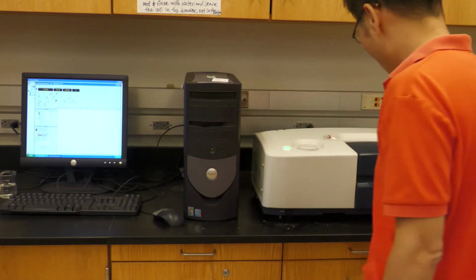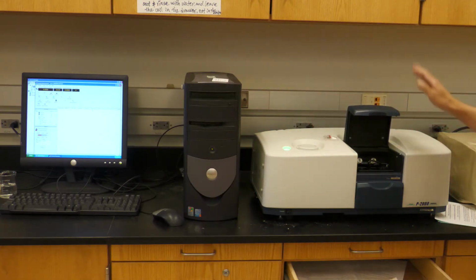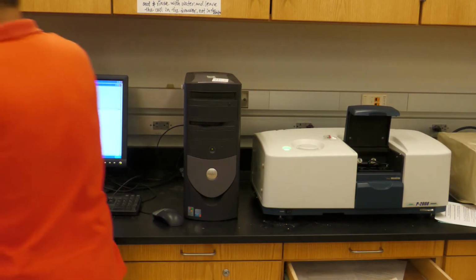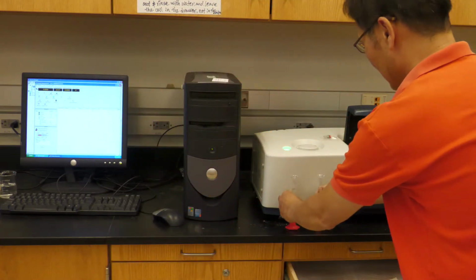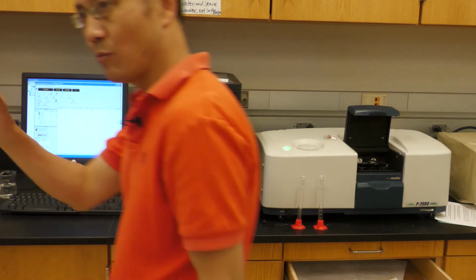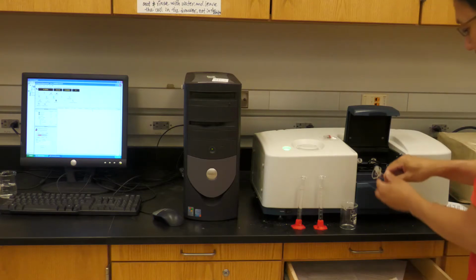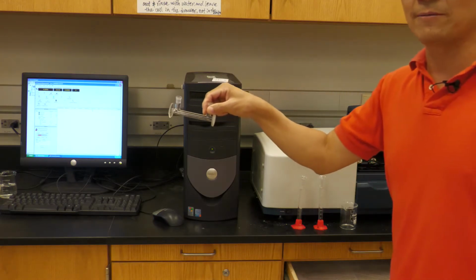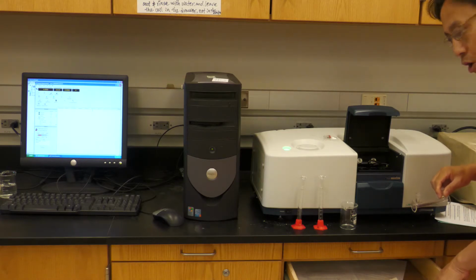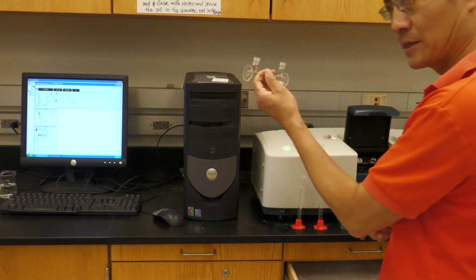Now let me show you how to do this one. Okay, before we start the sample, we need to open this guy. Okay. Now these two, we put it here. Okay. Now this is a beaker, so you want to measure this one inside the beaker. Now this one is a cell. This cell is quite expensive. Don't break this one. Okay. I suggest you leave this drawer open, in case you drop it in the drawer, not on the ground. Okay. When you do the experiment.